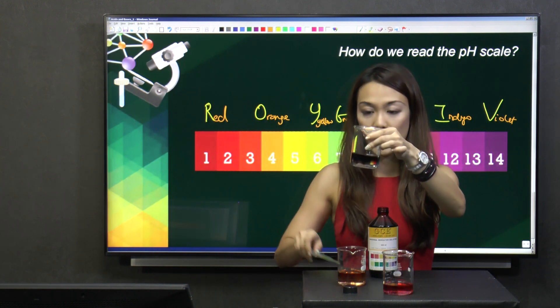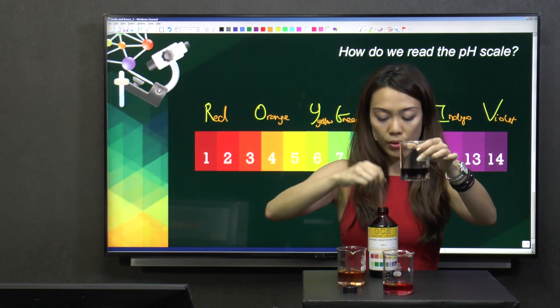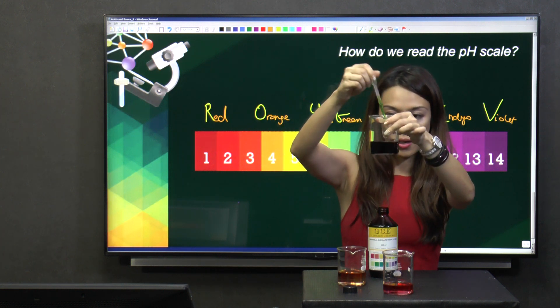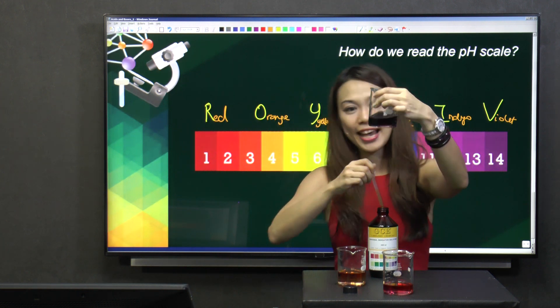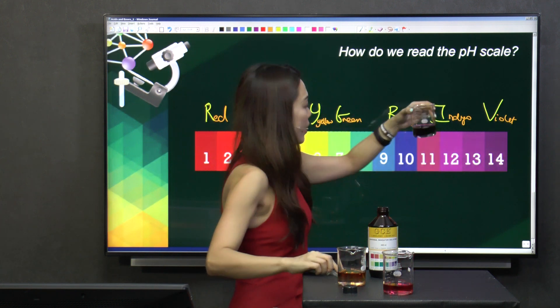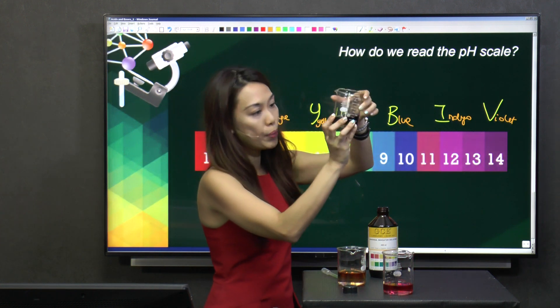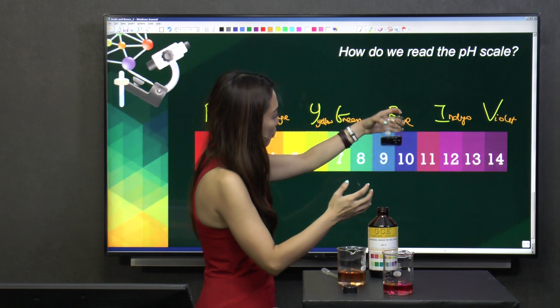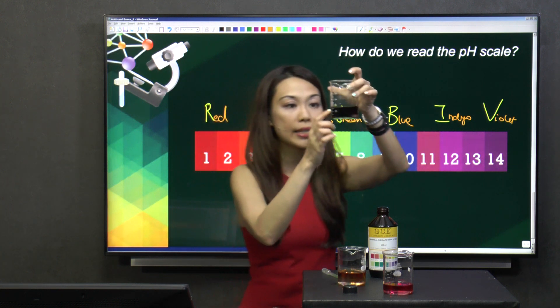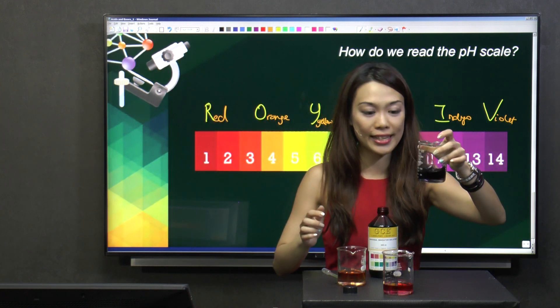I have a very pretty colour here. I want to intensify this colour. Whoa. Okay. Can you see this colour? It looks purple, purplish blue. A bit blue, a bit purple. Well, I can easily conclude that this is an alkaline solution.